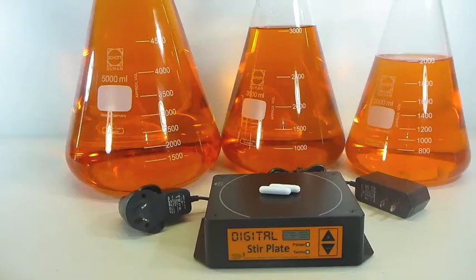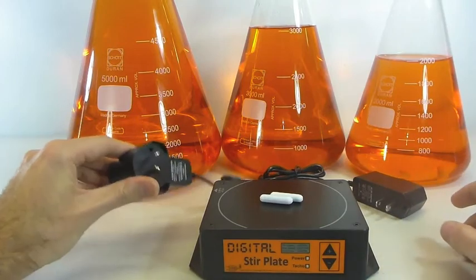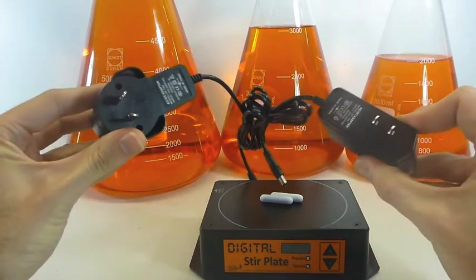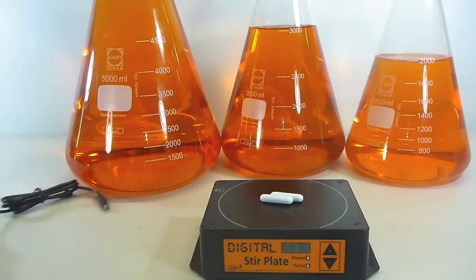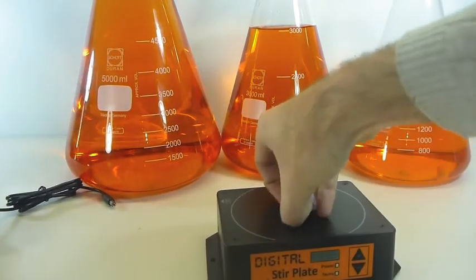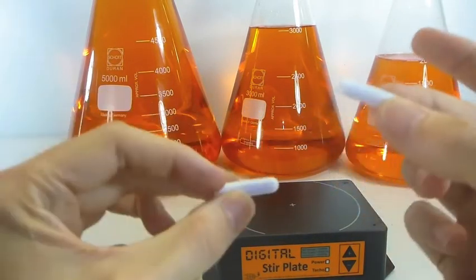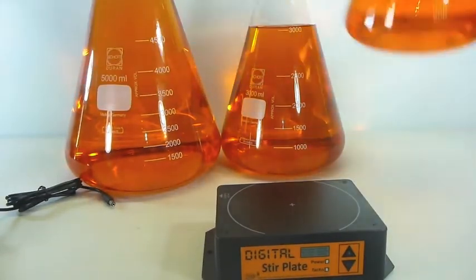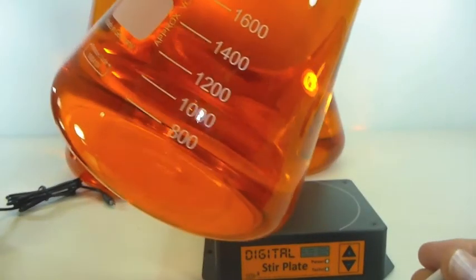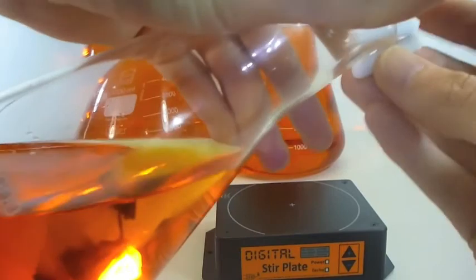What you get in the package is, of course, the digital stir plate, either an Australian or US plug pack depending on where you're buying from — or let us know if you'd like the other type when you check out — and two 30mm stir bars, which is really useful in case you lose one of them. But also, before you pour your starter into your fermenter, it's good if you can take out that bar using the magnetic attraction from your second stir bar, so you don't risk pouring your stir bar into your fermenter and losing it for the next few weeks.